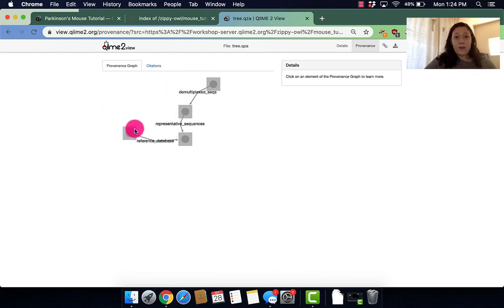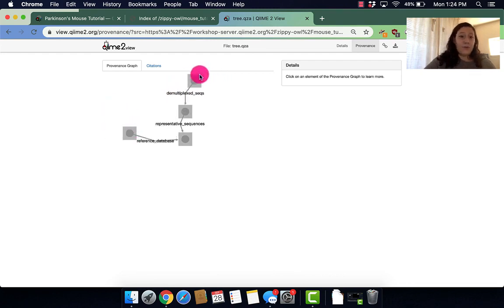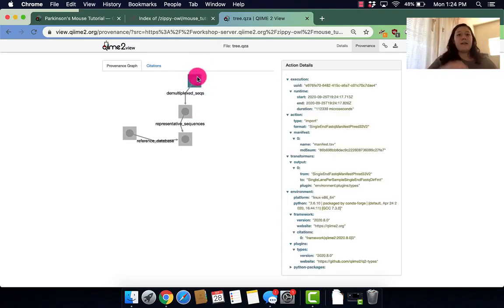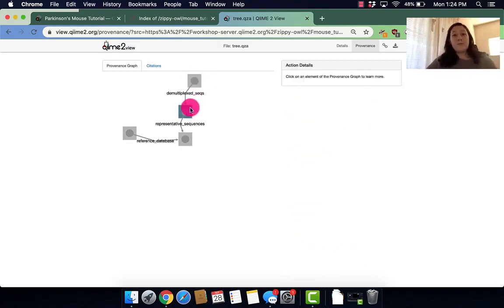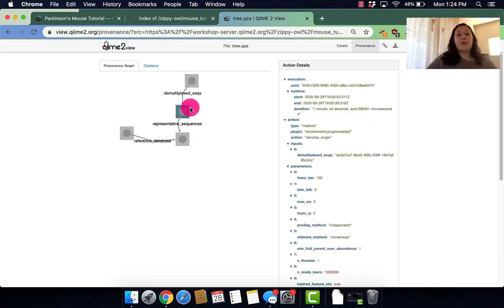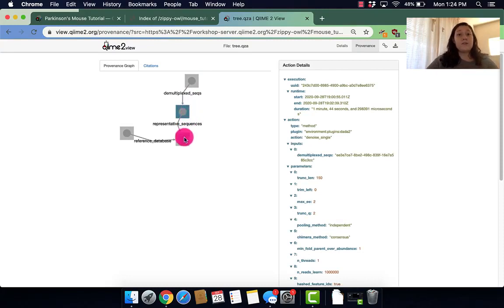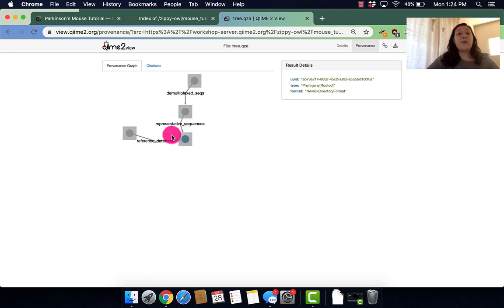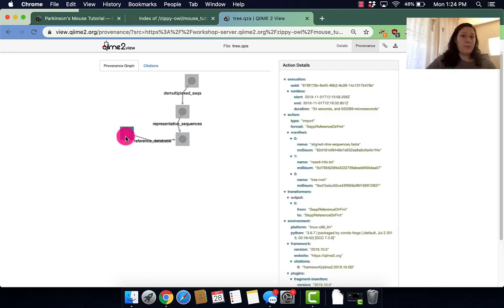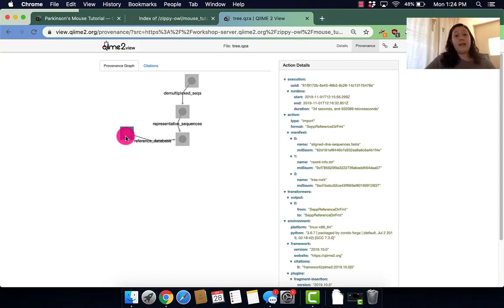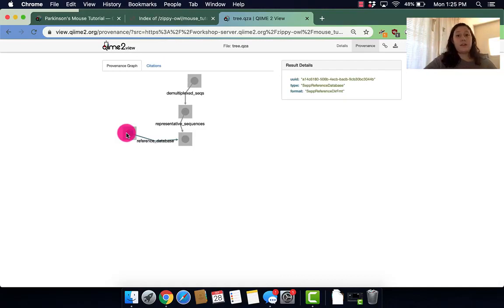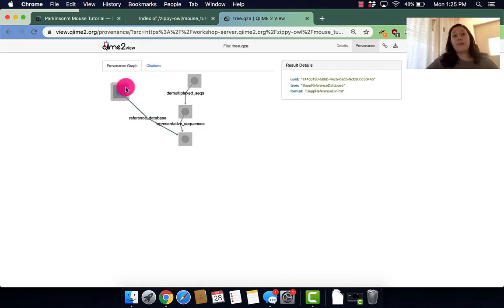So it's cool because you can move them around. I like to move it around so that I can visualize the path a little bit better. So this is where we imported our data. This is where we denoised our data. And this is where we created a phylogenetic tree. And this is where we downloaded our reference tree so that we could use it for this command.